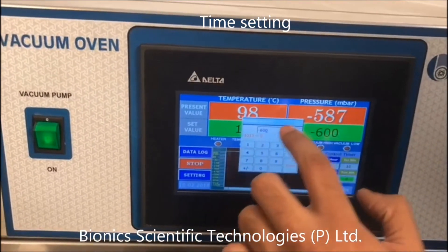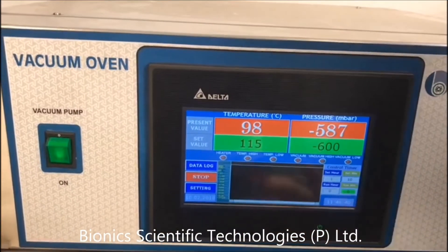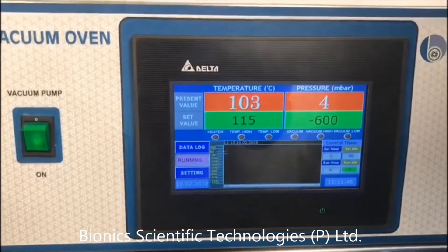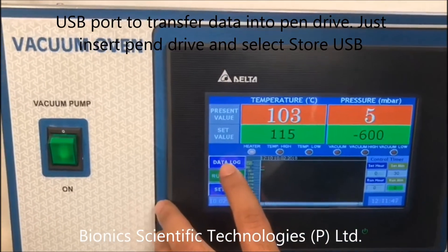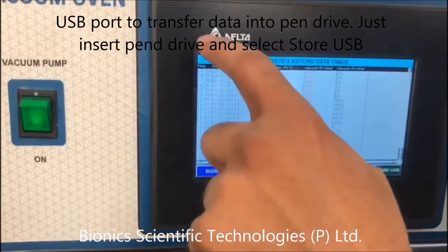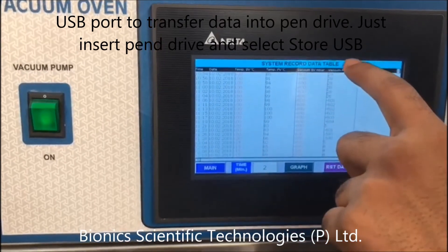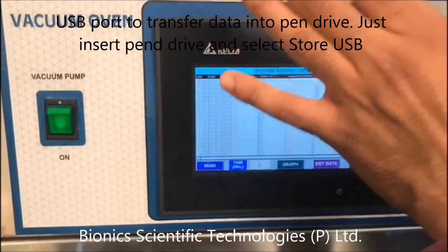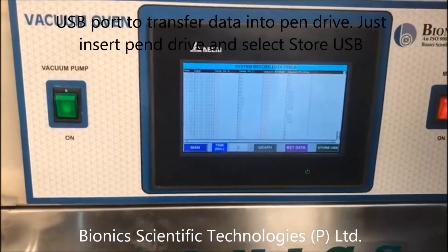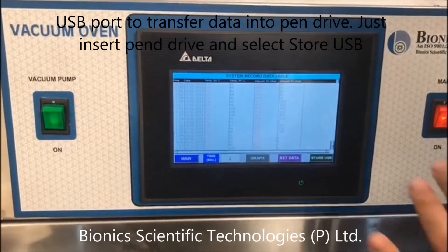So I will keep here minus 600. Now I will show you that you need to tap here on the data log. Like this — this is the time, this is the vacuum. It's showing that how your readings are in certain parameters when the time varies. It is available with all the data.